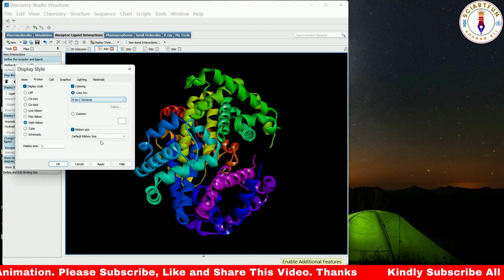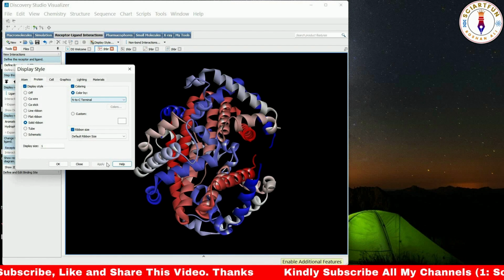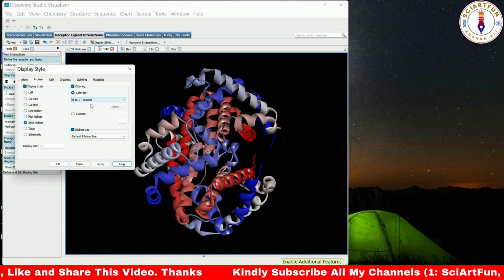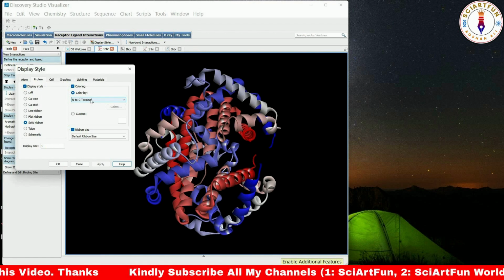And this option, that is N2C terminal, will color the residues in a continuous gradient from blue at the N terminal through white and then to red at the C terminal.